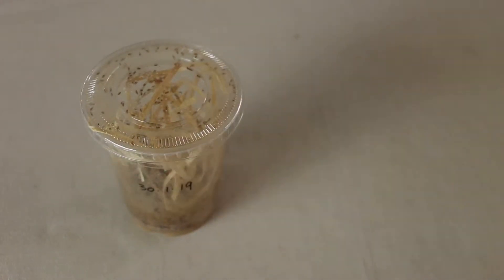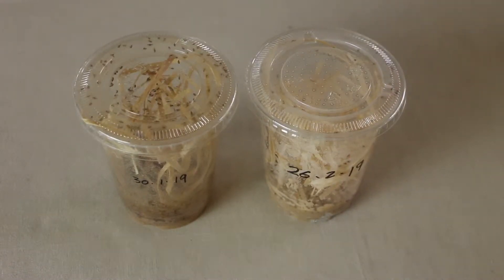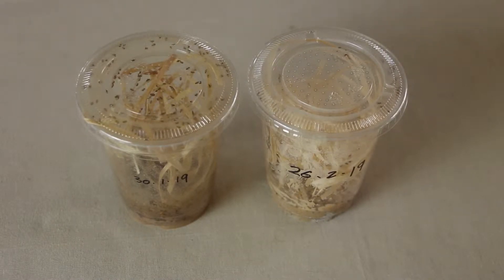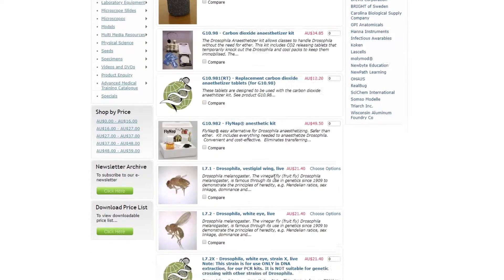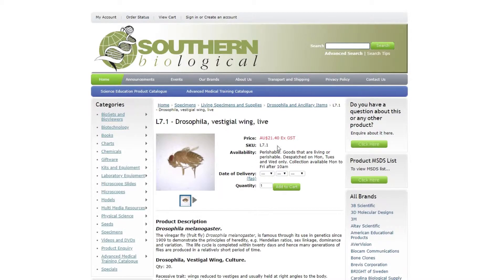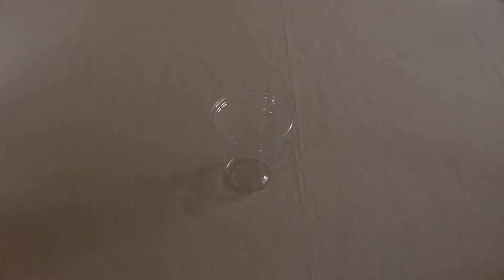But when new flies are hatching, it means that the life cycle of the culture might be nearly at its end and you will need to use some of those emerging adult flies to make new cultures so that you don't have to buy another one when the old culture dies out. On the flip side, if you have to order flies direct from a lab, like I had to, you will have to set up a proper culture immediately. Most of the time, lab flies are sent in vials and tubes that aren't intended for the flies to stay in long term. So let's start a new fruit fly culture.